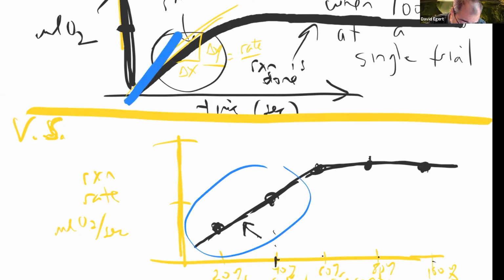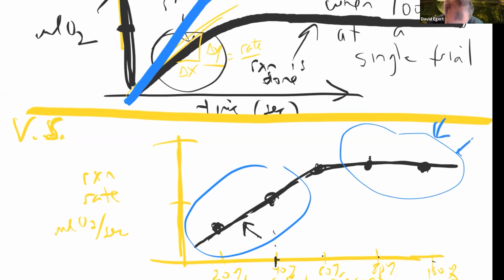These slopes are getting steeper. What about on this side? Here it's getting flat. What does this flat part mean? There's no more reaction. At the saturation? So we've ended up with enzyme saturation. So is there a reaction happening? No.